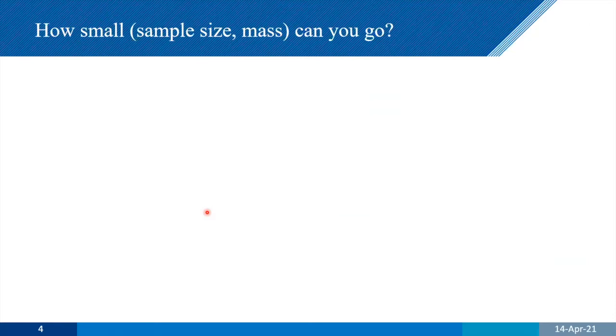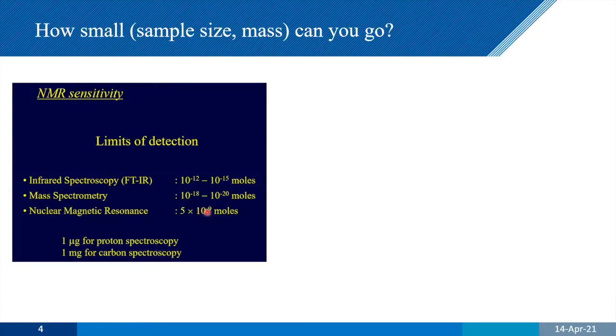So how small can you go? If you read textbooks in, say, analytical chemistry, then the problem with MR in general is it's incredibly insensitive. If we compare it with other spectroscopic techniques, infrared, mass spectroscopy, then we're orders of magnitude less sensitive, intrinsically, because we've got this Zeeman term in our energy levels, and there are just so few, the splitting is so small, and we can only detect that excess in the 2 energy levels, that intrinsically we're way down. And so typically we need about 5 nanomoles, something like that.